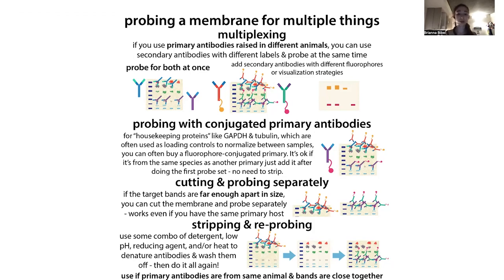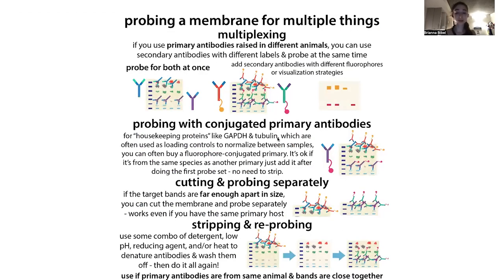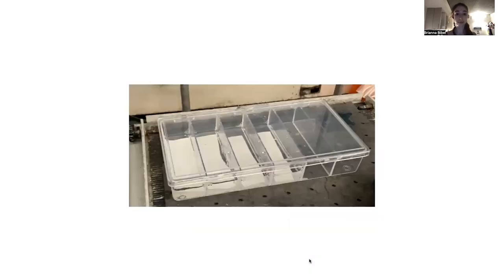Okay, finally, we have the more complicated form. And this is one I'm going to go into a little more detail on how we actually go about doing it in practice and why it works. So this is stripping and reprobing. So basically, you want to use some combination of detergent, a low pH reducing agent, and or heat. But your goal is to basically denature those antibodies. So like unfold them, get them to unstick, and wash them off so that you can then blot or probe for different things. And so this is helpful if you're using primary antibodies from the same animal and your bands are close together in size.